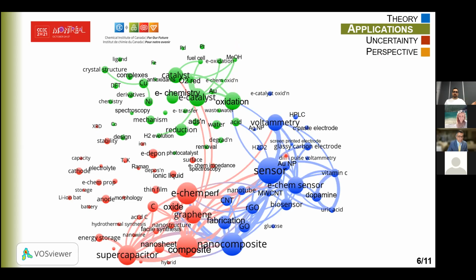For example, you want glucose monitoring for a diabetes patient or just a regular person, and they want to check their glucose levels. You can use cyclic voltammetry to determine at what potential a certain glucose concentration is found. Then from using the sample, we're able to say, okay, if it's reached this potential, we can see how much concentration of glucose is in the system. The fourth point is films and conductive materials. And finally, metal organic frameworks or MOFs, which are similar to catalysts, and the same ideas of redox properties can be determined.